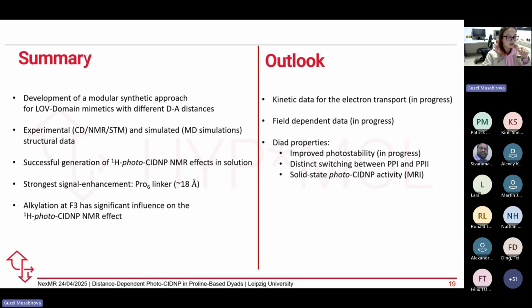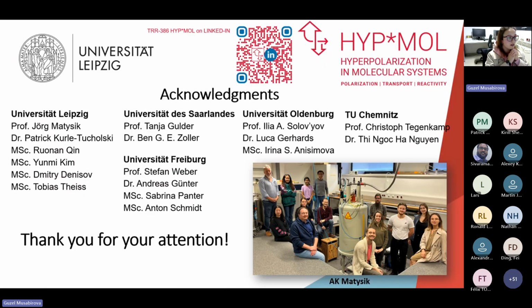And I didn't mention it, but N-butyl and NH substitution show different CIDNP enhancement. It's most probably because this butyl chain just creates steric hindrance for possible intermolecular electron transfer.